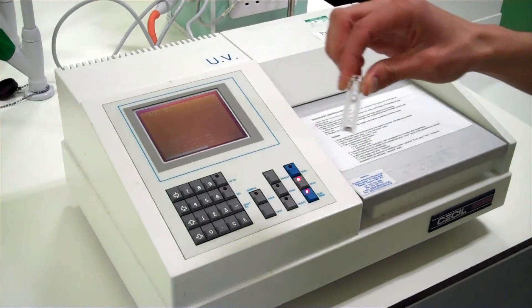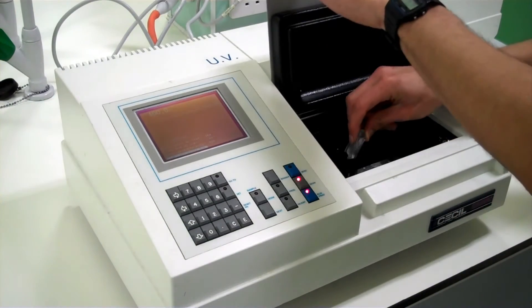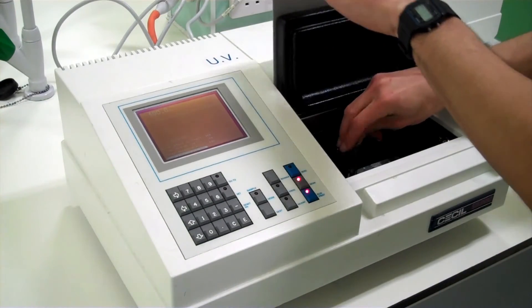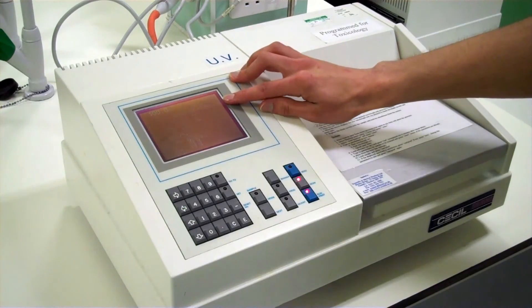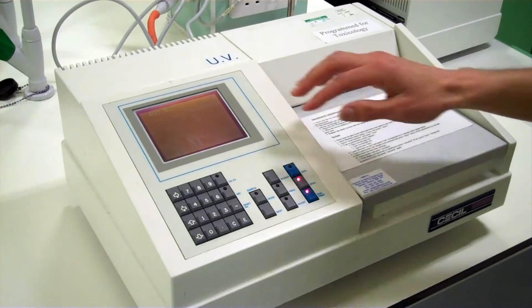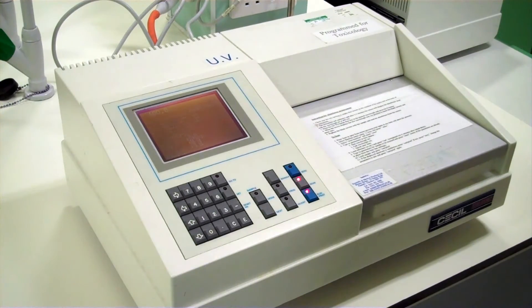Then we can load our blank and press run. The screen will say storing baseline. The blank tells the spectrophotometer what zero is so the absorbance of the cuvette and solvent are accounted for.